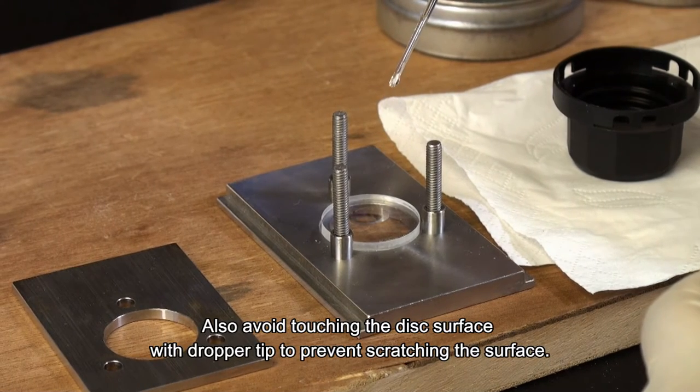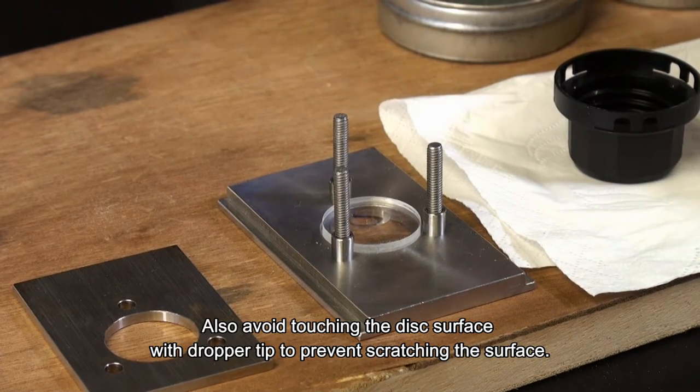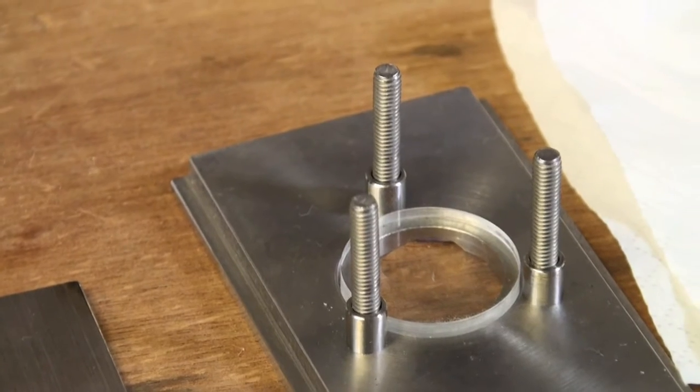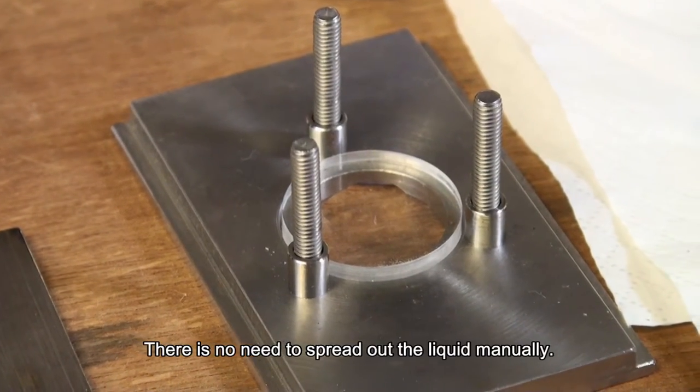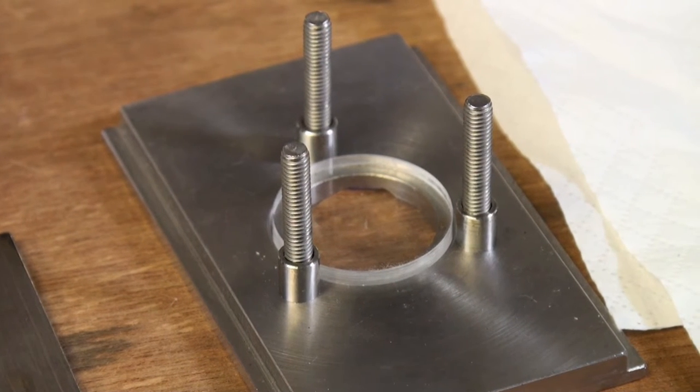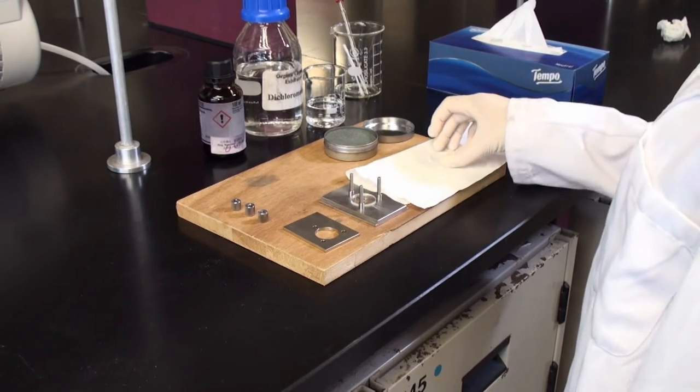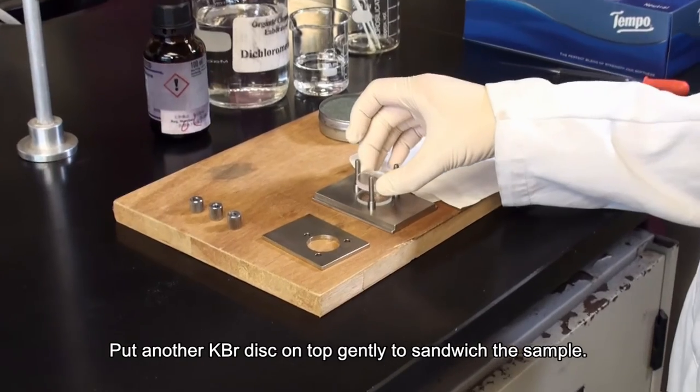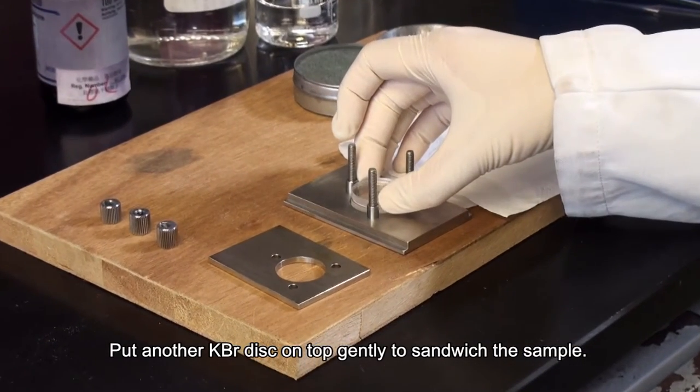Also, avoid touching the disk surface with the dropper tube to prevent scratching the surface. There is no need to spread out the liquid manually. Put another KBr disk on top gently to sandwich the sample.